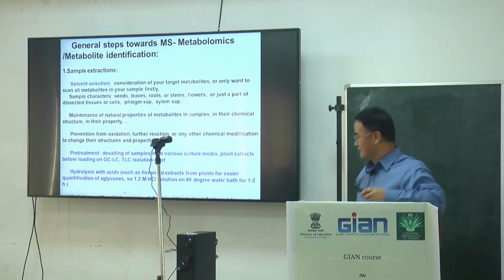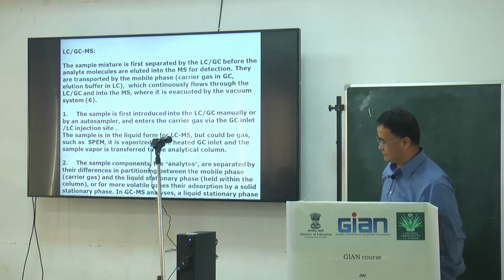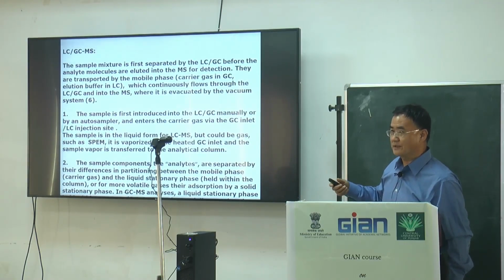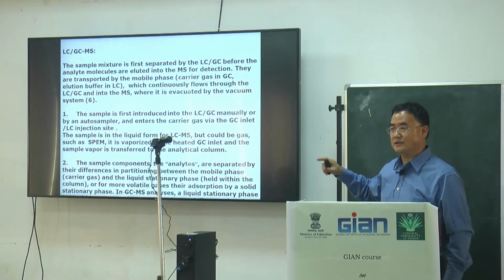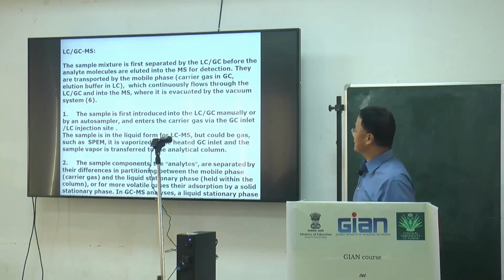So these are just several examples of how we prepare the sample for simpler, quicker identification. If you have some new, interesting compound, you use the regular way to get rid of the other non-interesting compounds and to find some interesting new compound, so as to do further study.